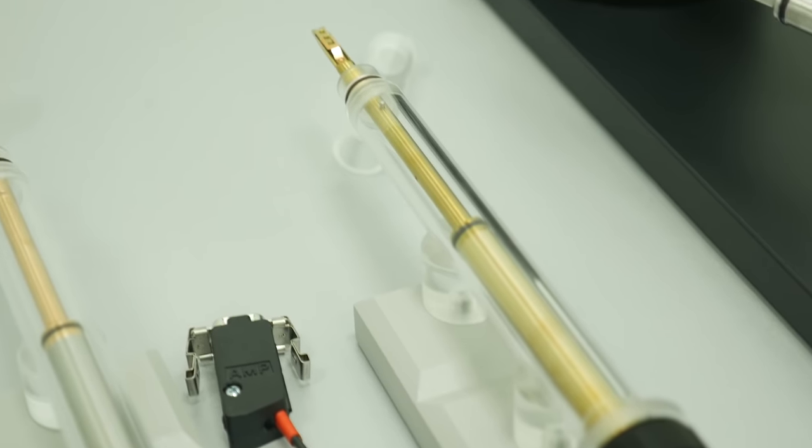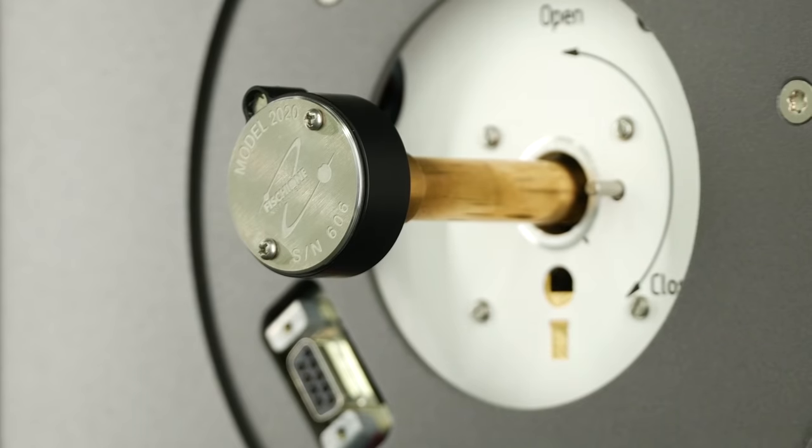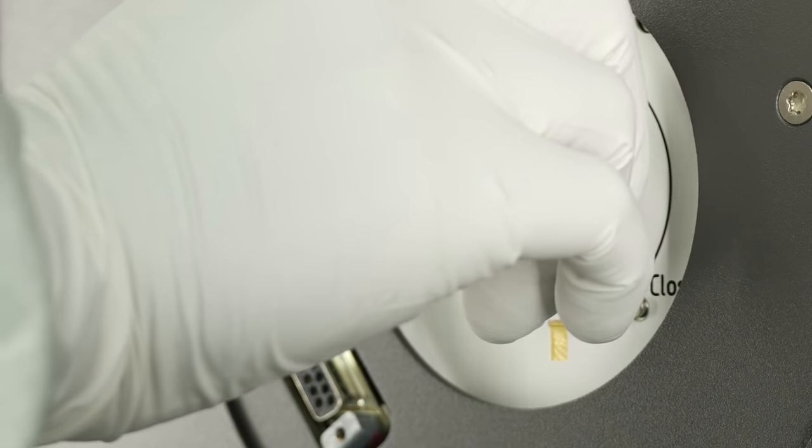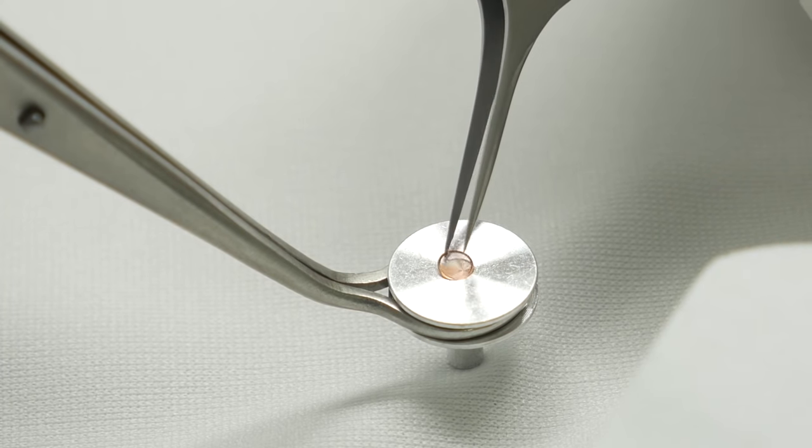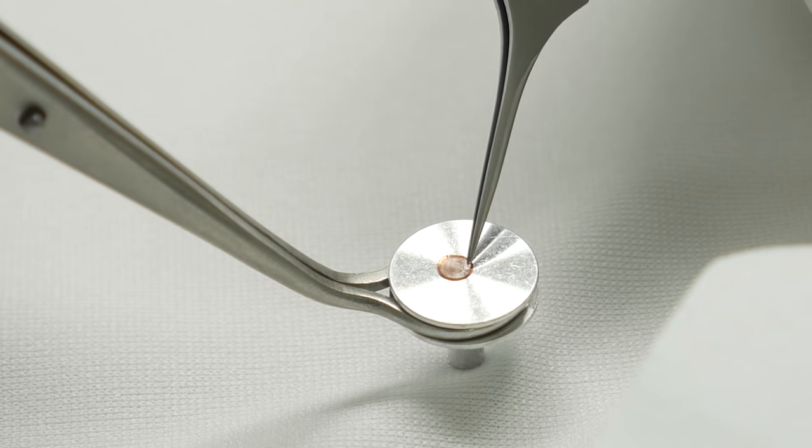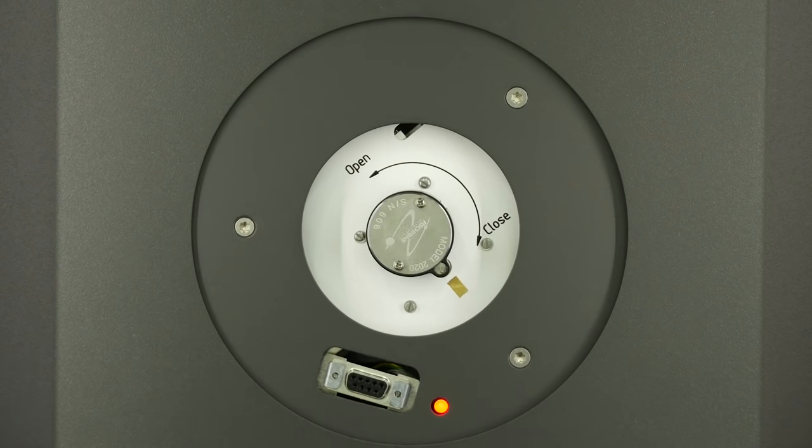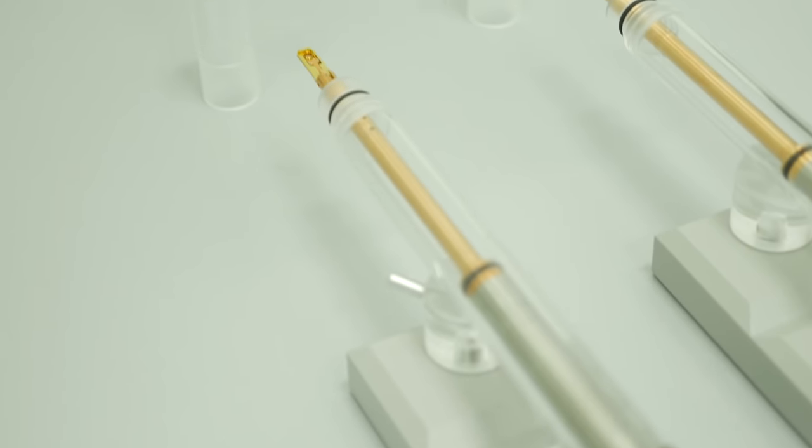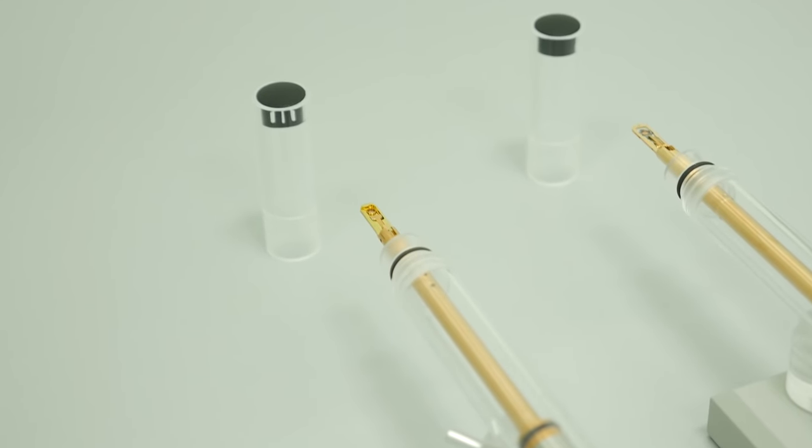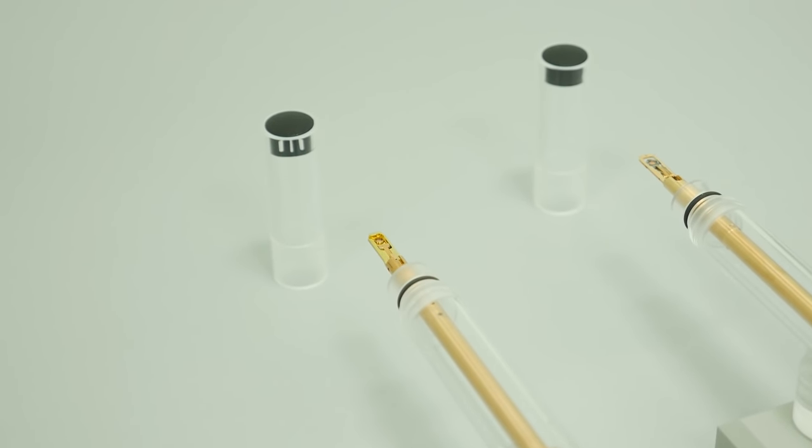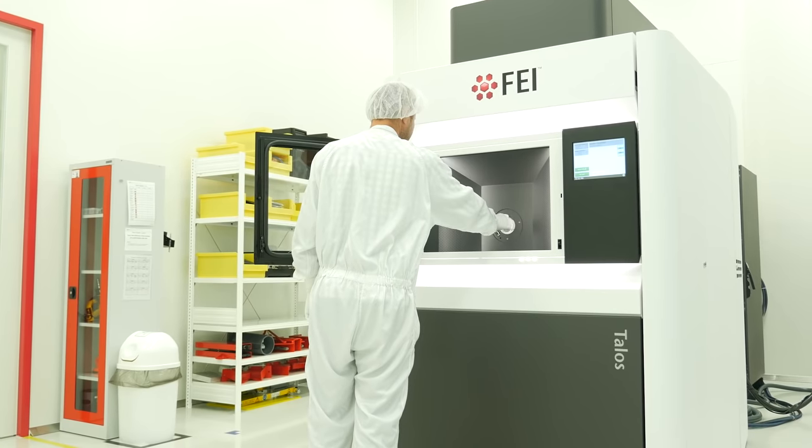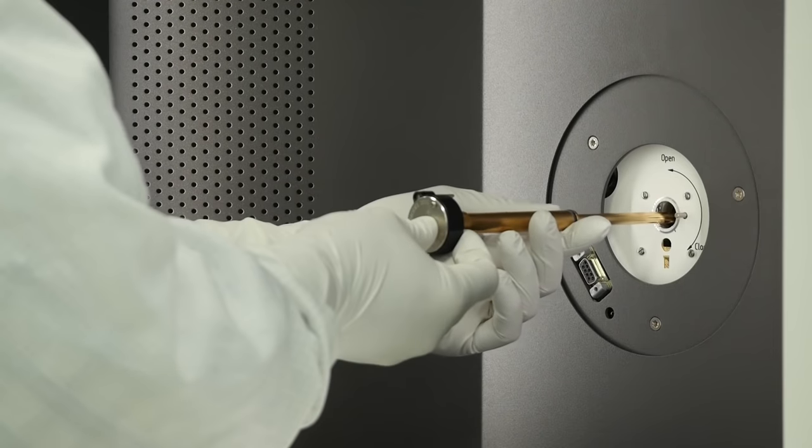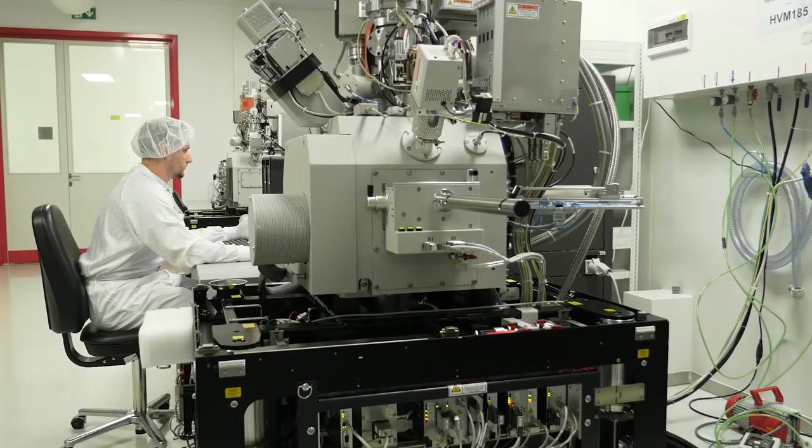The sample for the transmission electron microscope is very thin, several hundred nanometers, and it is placed on a grid. If it wasn't thin, electrons would be stopped and no image would be created in the transmission microscope. There are various holders available for the examination of samples in the transmission microscope, depending on the application a customer would like to use. Here we can see a holder where more samples can be placed at the same time.